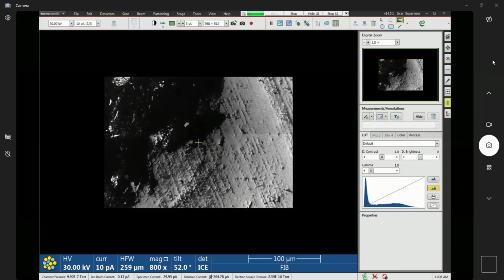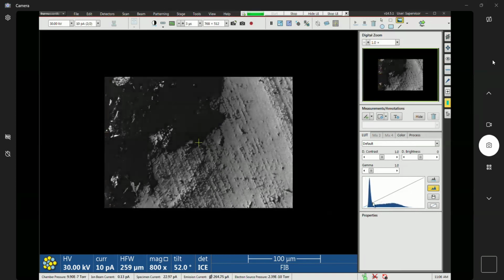So what I'm going to do here is decrease my contrast, and then bump up my brightness so that I don't have these all the way down. And this is also perfectly fine. It's fine to have a little bit of headroom at the top, and then I guess you wouldn't call this headroom at the bottom, but so you're not bottoming out the signal or maxing out the signal. Another thing to check obviously is your detector contrast and detector brightness as well.